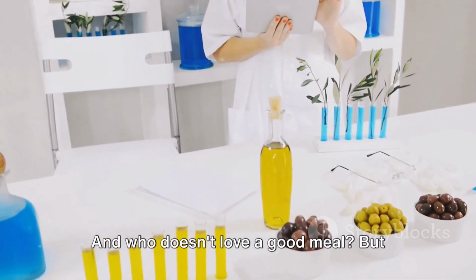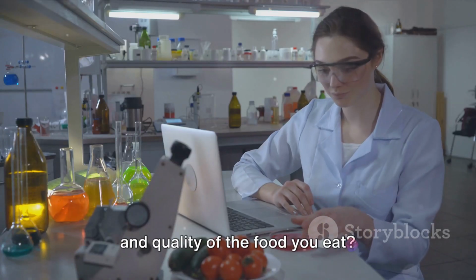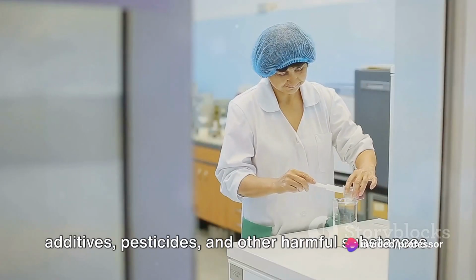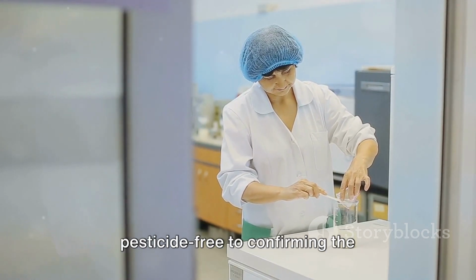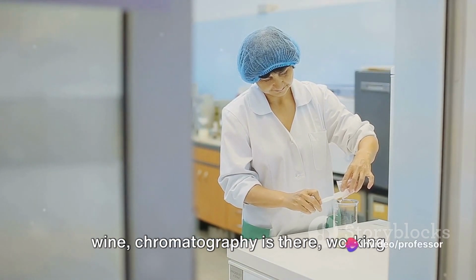And who doesn't love a good meal? But have you ever wondered about the safety and quality of the food you eat? Chromatography is your silent guardian. It's used in food testing to identify additives, pesticides, and other harmful substances. So from ensuring your apple is pesticide-free to confirming the authenticity of that expensive bottle of wine, chromatography is there, working behind the scenes.